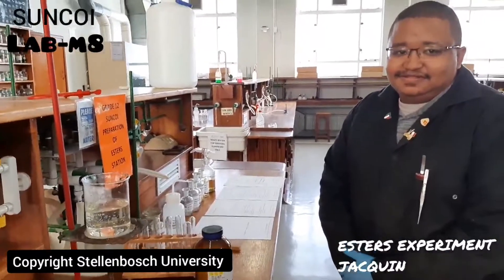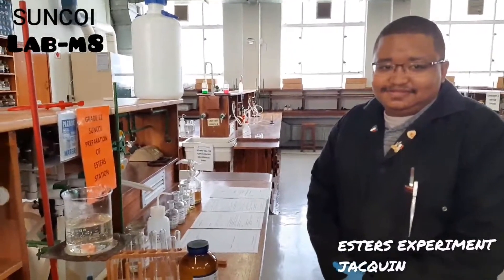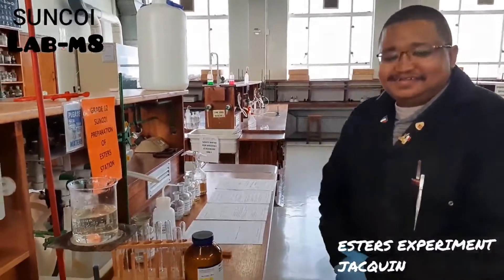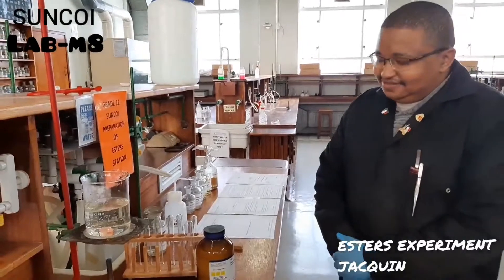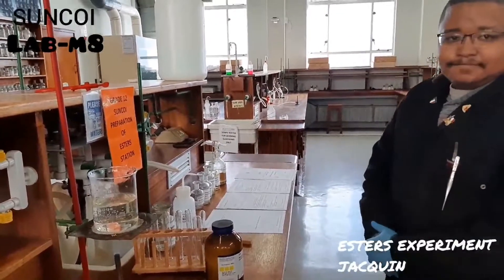Welcome to another installment of Lab Mates. Your lab mate today is Jaquin. Hi guys. Jaquin is going to take you through the preparation of esters, which is your Grade 12 prescribed practical.